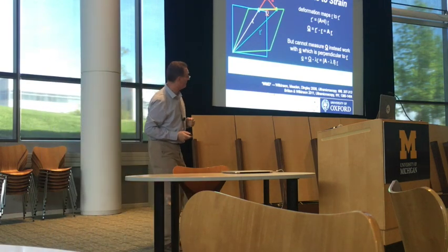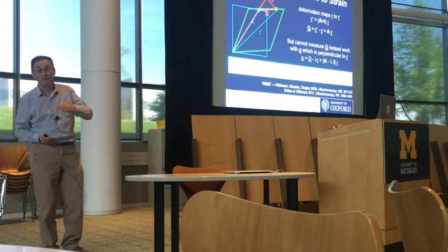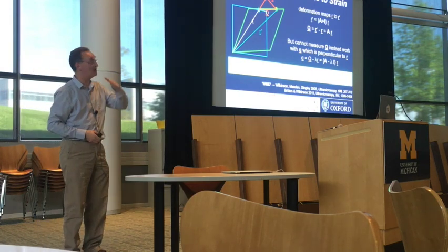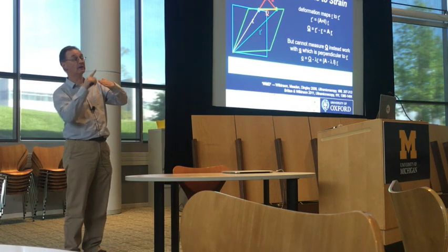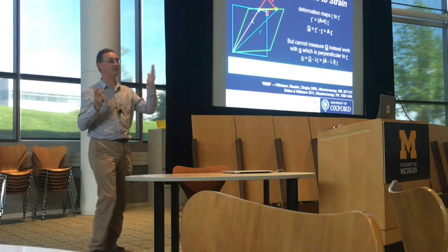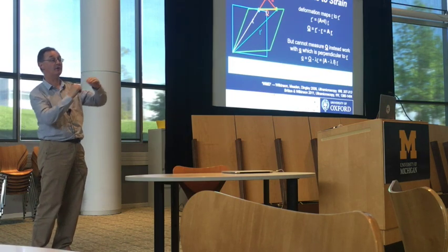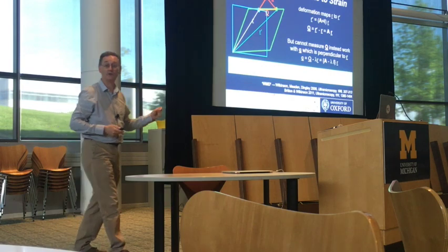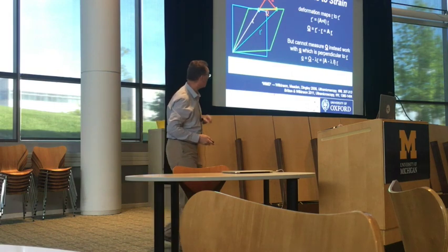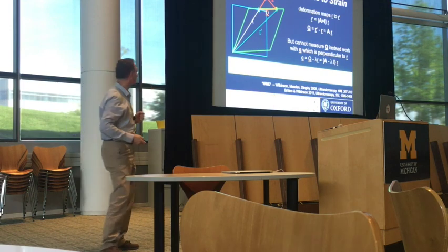Okay. And the way we fix the hydrostatic strain is to say, well, we know we're making the measurements at the free surface, or very close to the free surface at least, probably just a little bit below that surface, and we know something about the stresses at the free surface. A little bit of mechanics tells us that the stress perpendicular to that surface must go to 0, otherwise the surface would move. Okay? And so we take the direct stress across that surface and put that to 0, and that gives us an extra constraint, as long as we know the elastic constants, that closes out the hydrostatic strain. And at that point you have all the components of your lattice rotation and lattice strain.